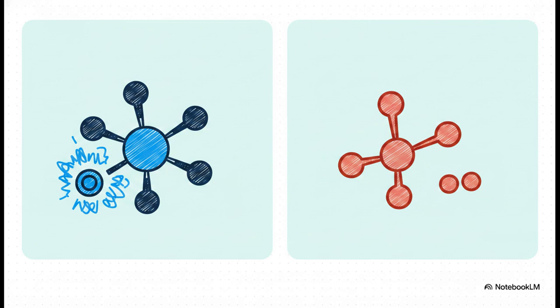When that initial molecular ion forms, it's called an odd electron ion. Interestingly, if the original molecule contained no nitrogen, this odd electron ion will actually have an even mass. Later on, when this ion breaks apart, it might form an even electron ion, which totally counterintuitively will have an odd mass. I know it sounds a bit backwards, but these definitions are the absolute foundation for understanding the chemical pathways our molecule is going to take as it flies through the machine.